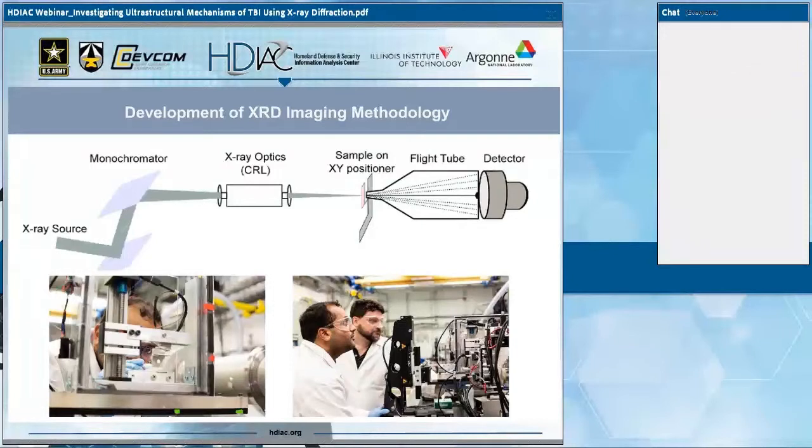So building on the initial experiments with isolated optic nerves, I should explain briefly that this was a very intentional progression of experiments, our desire to characterize the structure to insult response, if you like, the dose and the response of each element that would be relevant to that which causes mild moderate TBI. We isolated tissue elements, isolated tissues, then isolated components of complex composite tissues as we gradually build up towards whole organism studies.